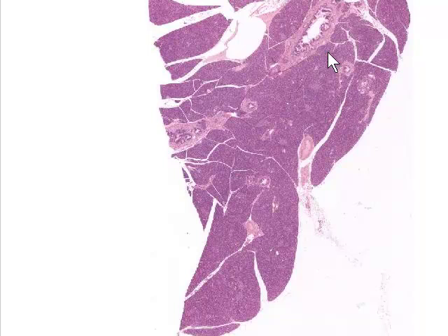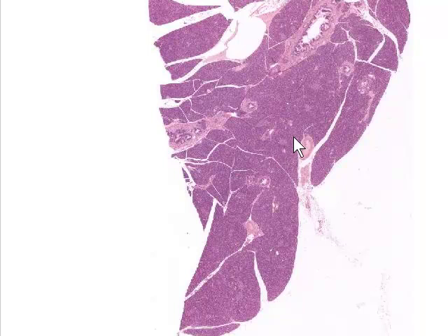At this low magnification, it's a good opportunity to point out that the ducts which drain the pancreas are classified as two different types. There are interlobular ducts — ducts between lobules — such as this one here, and this one here. These are ducts found in the connective tissue that separates lobules. Then there are intralobular ducts, which we'll see when we increase magnification.